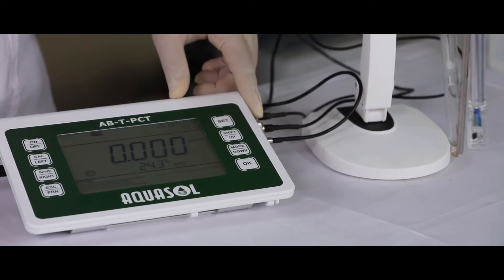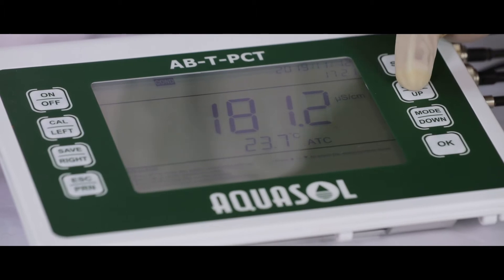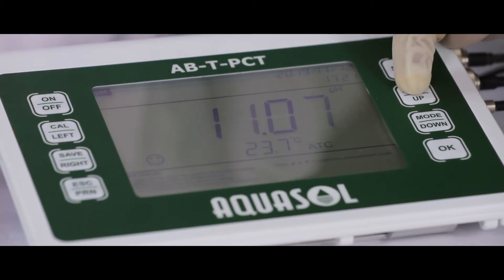Switch on the meter. Using shift key, you can shift between pH, ORP and conductivity.